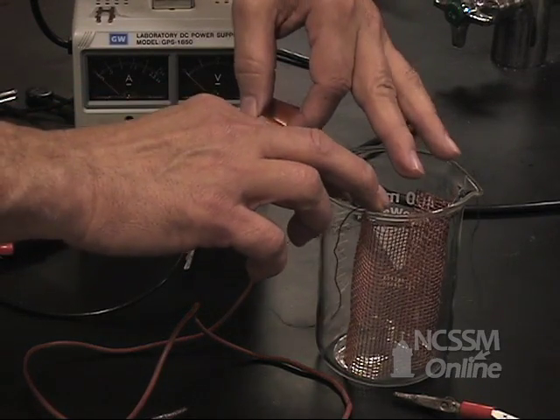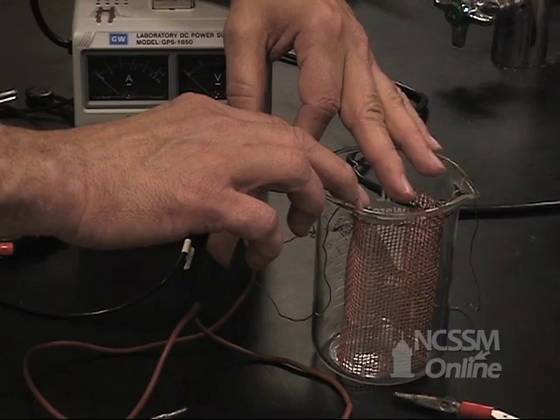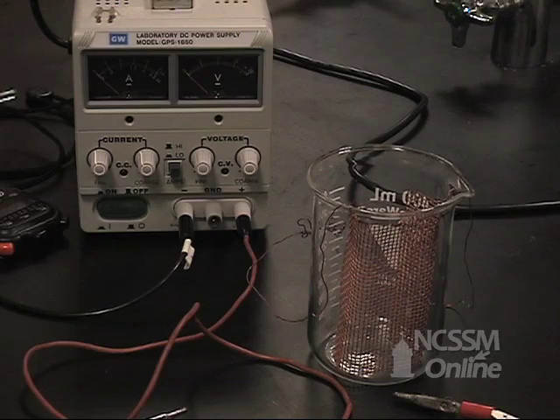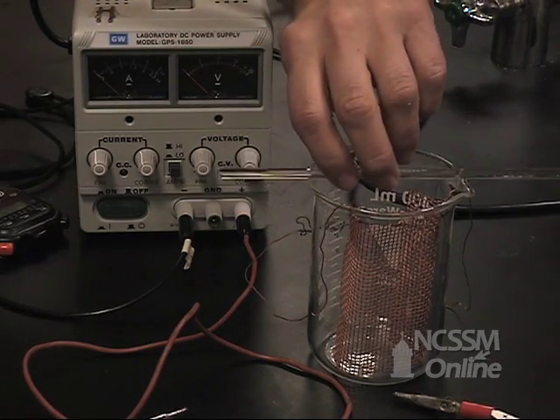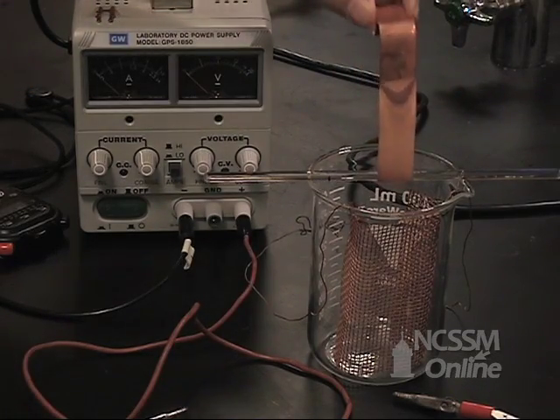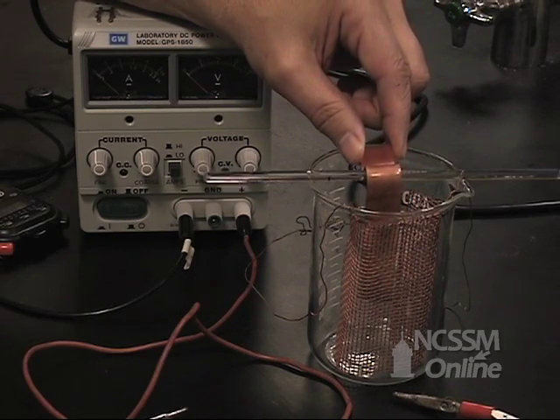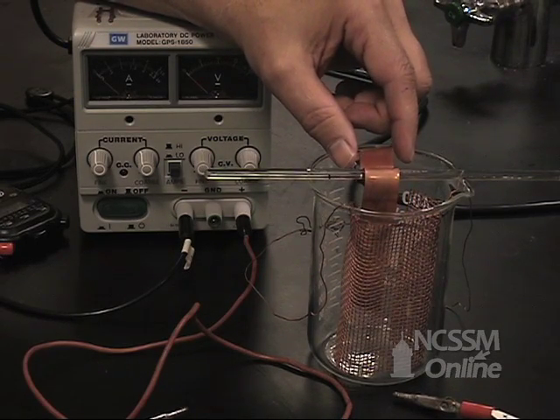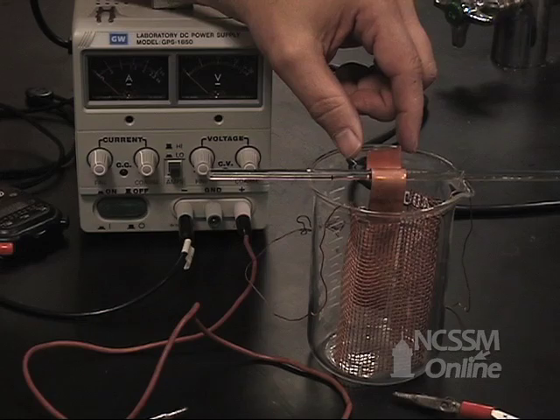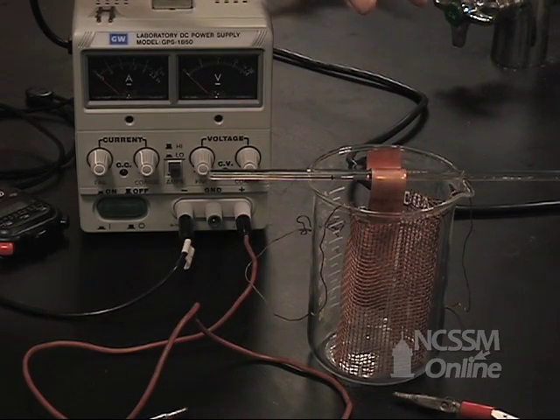We're going to place our copper mesh into a 400 milliliter beaker. Across that we're going to put a stirring rod, and we're going to support the anode from that glass stirring rod. That copper anode is going to sit in the middle of our copper mesh.